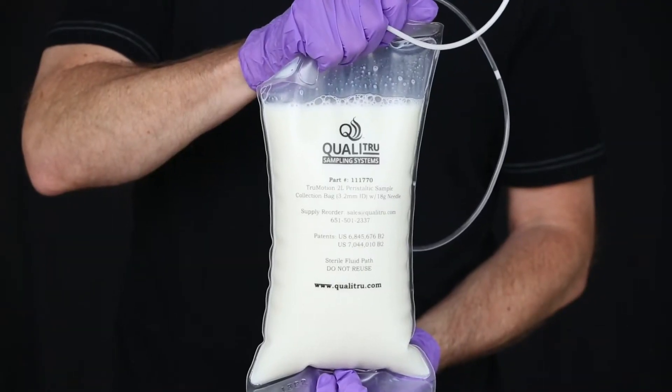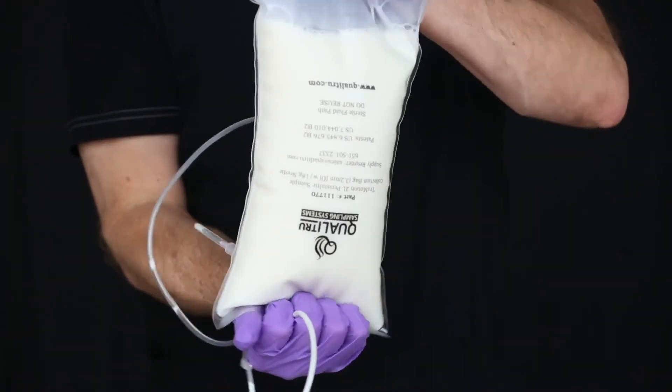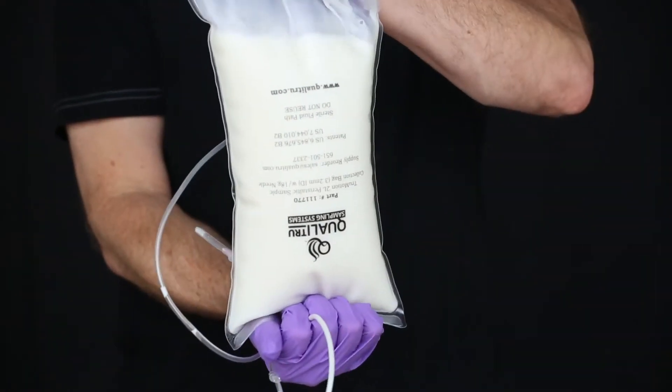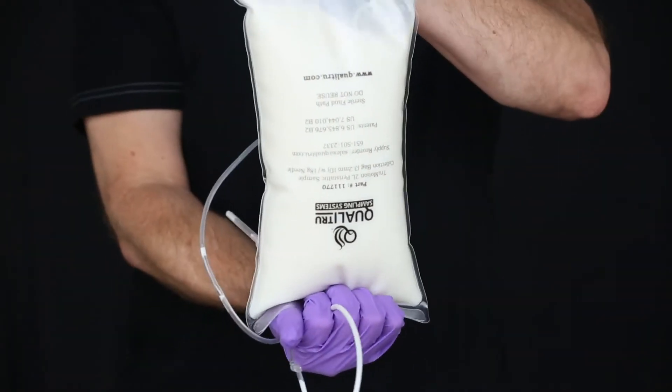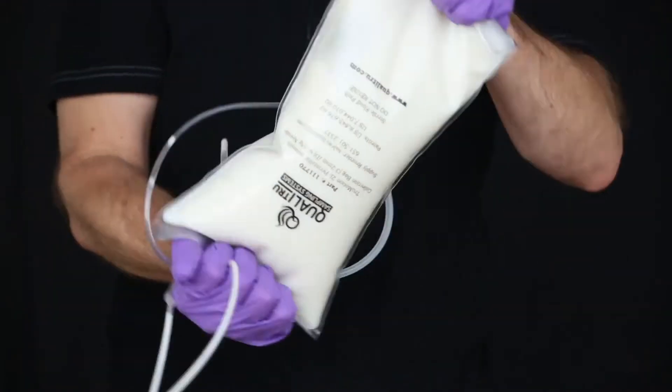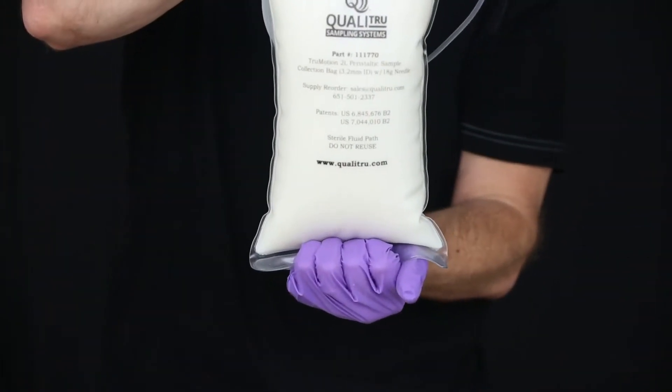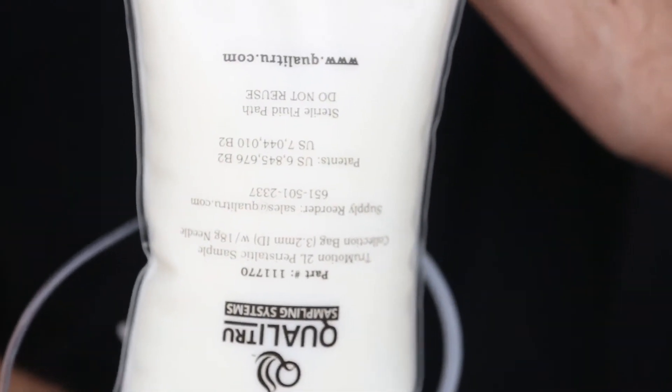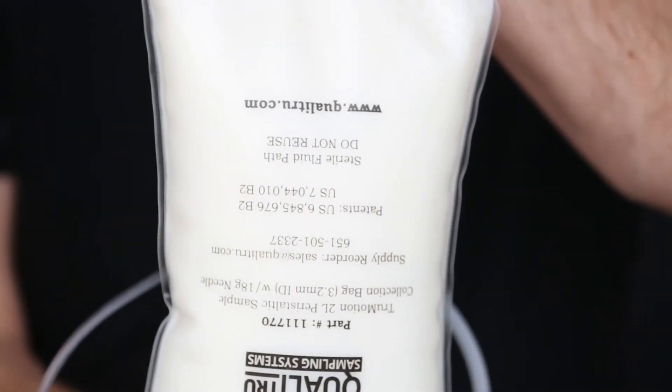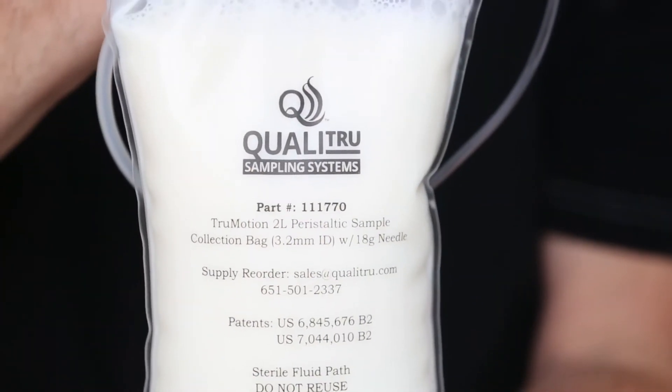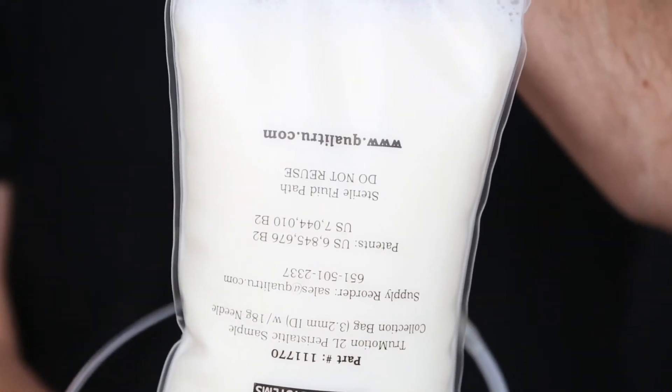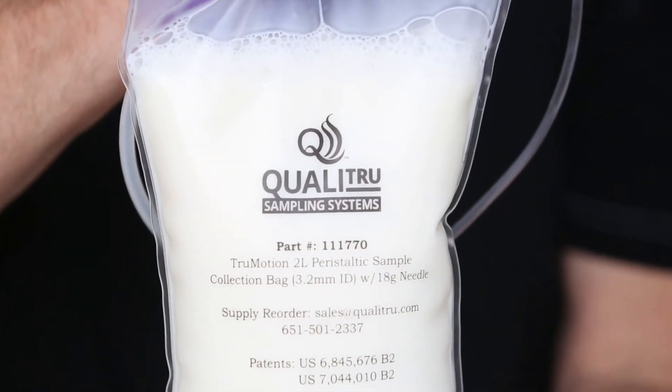The person certified to take the sample should remove the bag from the refrigerator and agitate the sample 25 times to ensure even distribution of the raw milk prior to filling the sample vials. For proper agitation, roll the bag 180 degrees upside down and then return upright, visualizing the butterfat cascading with each turn.